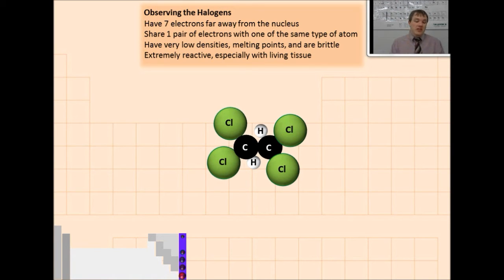What you should see, though, is as this molecule is produced, there should be an extremely violent reaction between the chlorine gas molecules and the acetylene molecules with that triple bond and those 6 electrons packed inside.